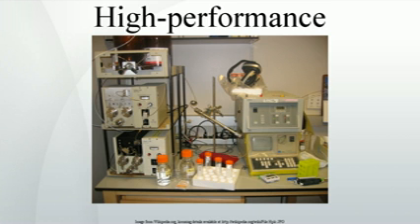HPLC columns should be flushed with clean solvent after use to remove residual acids or buffers, and stored in an appropriate composition of solvent. The metal content of HPLC columns must be kept low if the best possible ability to separate substances is to be retained. A good test for the metal content of a column is to inject a sample which is a mixture of 2,2'-bipyridine and other compounds. Because the 2,2'-bipyridine can chelate the metal, the shape of the peak for the 2,2'-bipyridine will be distorted, tailed, when metal ions are present on the surface of the silica.